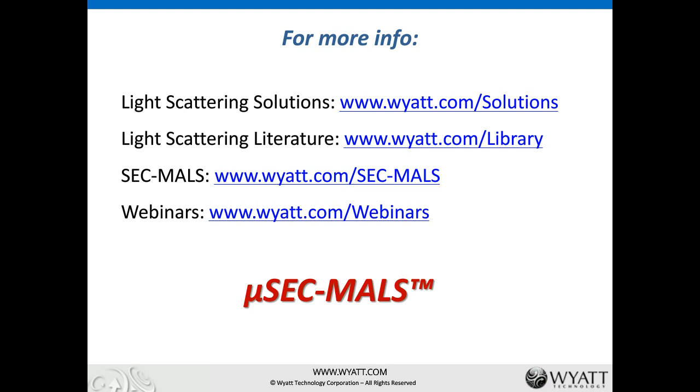In the case of the NIST mAb, 0.185 is a really good guess, but since we know the extinction coefficient of the NIST mAb, it's published by NIST, it's 1.42, I believe. So if we use that, that would be the other way around. You can figure out the recovered mass from your UV signal, and then figure out what the dn/dc value should be to reach the same recovered mass. And it turns out it's not 0.185. It's very close. It's 0.187. It's about 1% off. But either way, it's really quite acceptable in the case of molar mass determination with MALS.